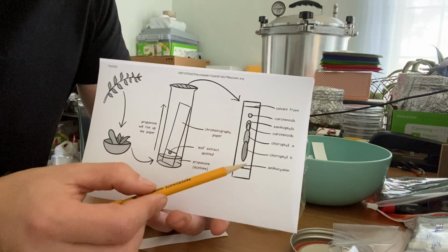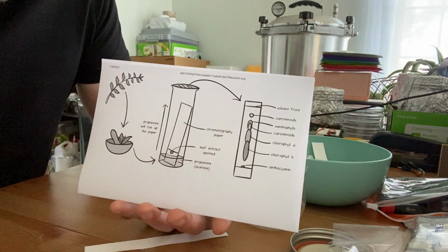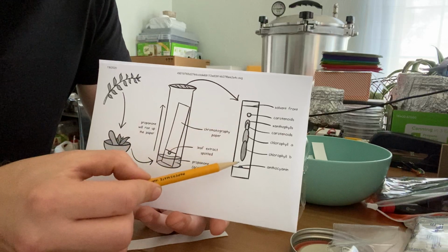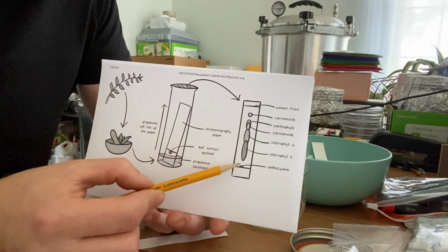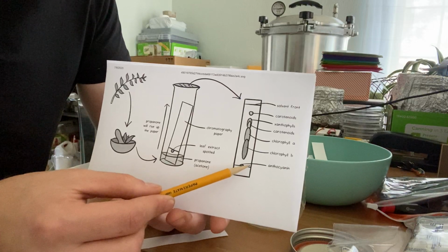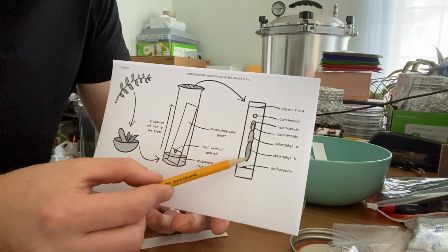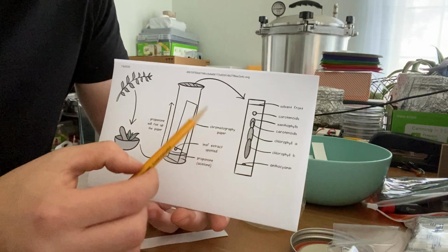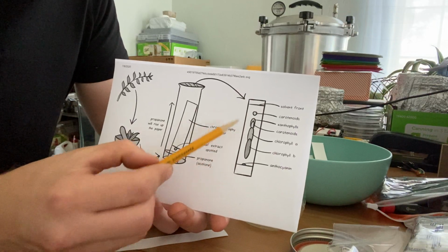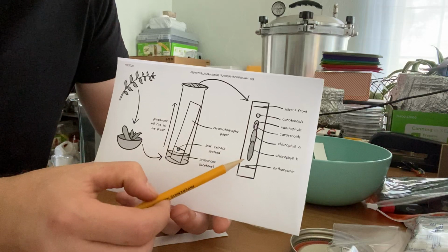Well, how do we know what's in there? Well, it turns out that different compounds, because they have different polarity and solubility, will travel at varying distances up the stationary phase, which is this piece of paper here. And we call that measurement RF, or retardation factor, which is a ratio of how far the individual compounds travel, so let's say we're using a leaf and chlorophyll's here, we can do a ratio of how far did the chlorophyll go up versus how far the solvent front ended up being. This is basically where the solvent stopped getting soaked up by the paper.